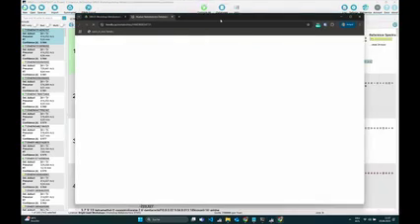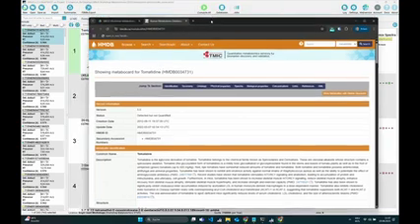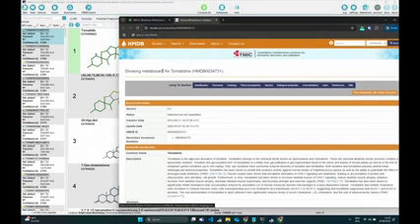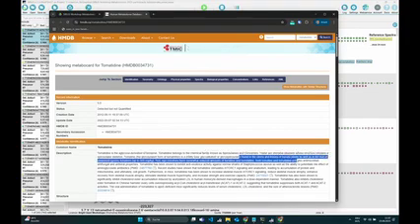Because what I didn't tell you, but what was probably visible by the name a little bit, the data that we have imported is from a tomato dataset, and also the hit that we have now found is tomatidine. So this seems to fit quite well. And if we go to the tomatidine page in HMDB, we can see, for example, one thing I want to highlight is that this compound belongs to the spirosolanes class, which is also the one that we found in the compound class prediction tab. So this is a good sign that this matches. And what you can also see, this compound is found in the stems and leaf of tomato plants as well as in the fruit. So it's always nice to just look at this a little bit and see if it matches with your expectations. Okay, but now let's close this.